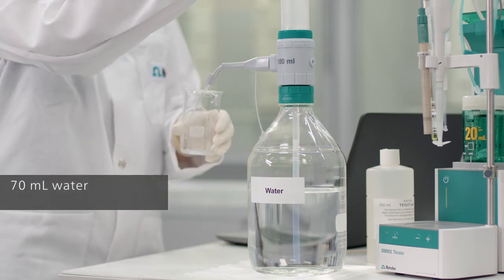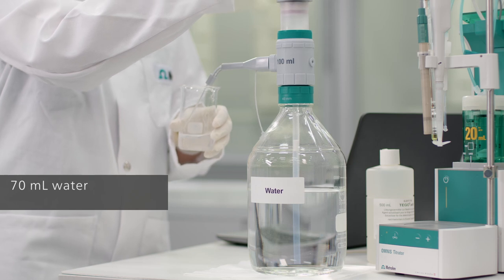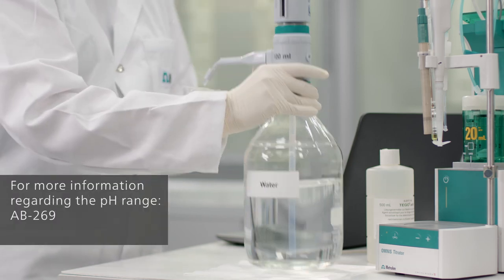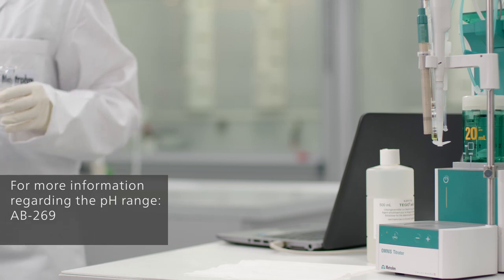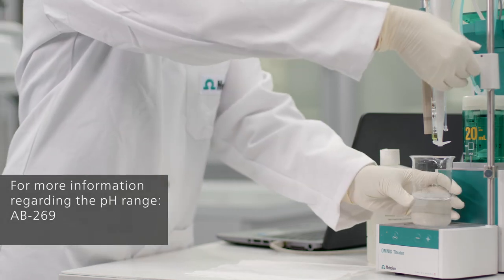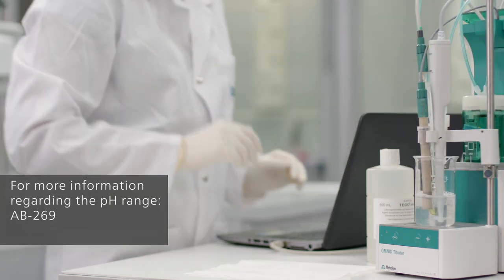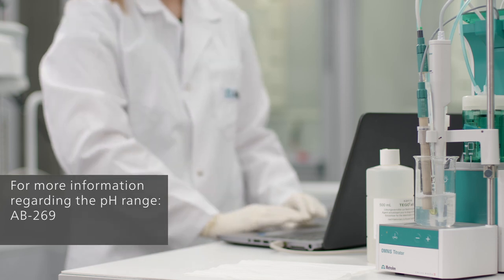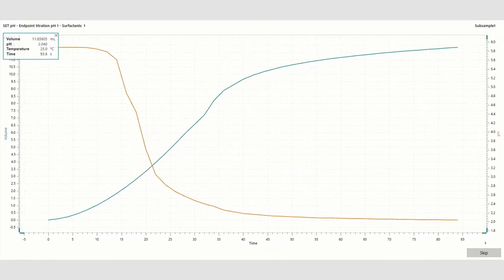The pH must be adjusted before the actual titration starts. For most anionic surfactants a pH of 2-3 is a good range, while for most cationic surfactants the pH should be adjusted to a range of 4 to 5. This is easy to do with a set pH titration.